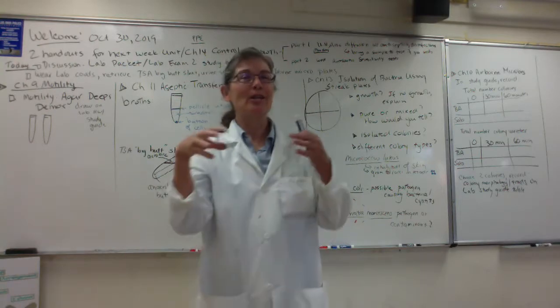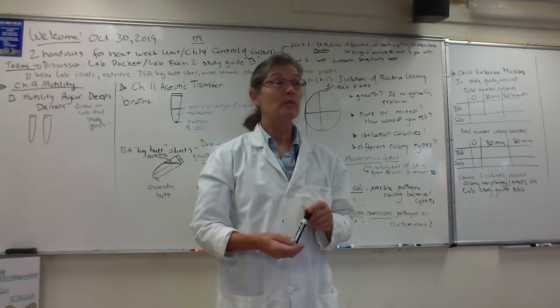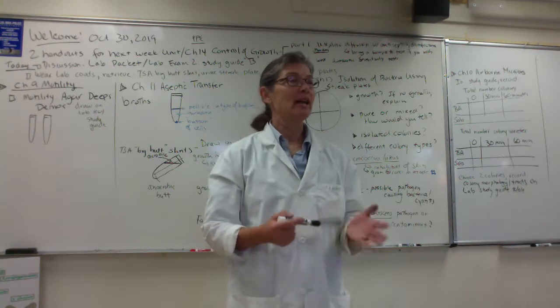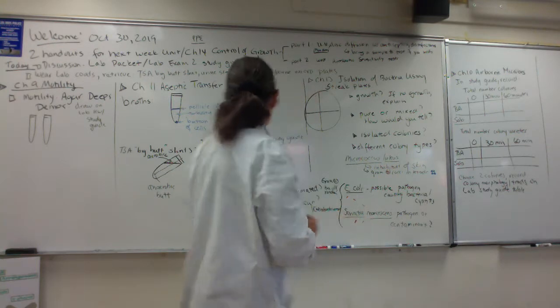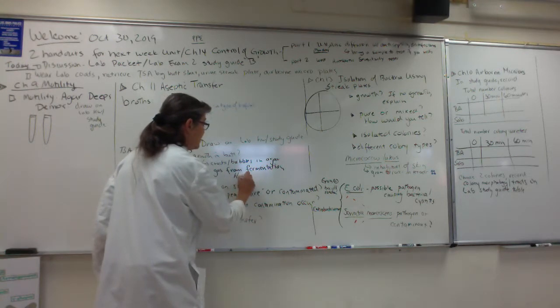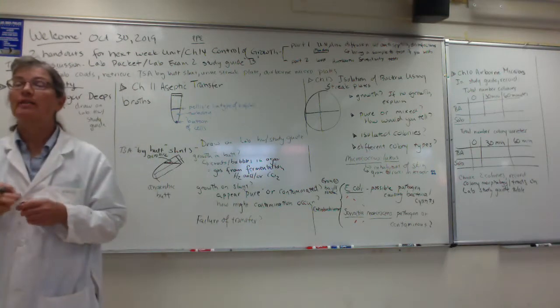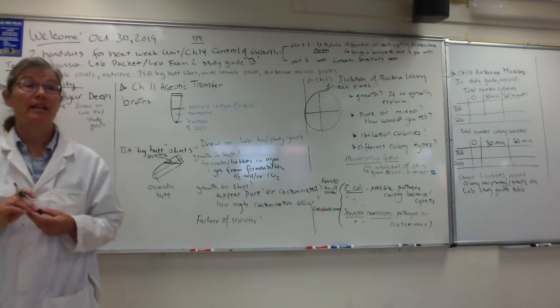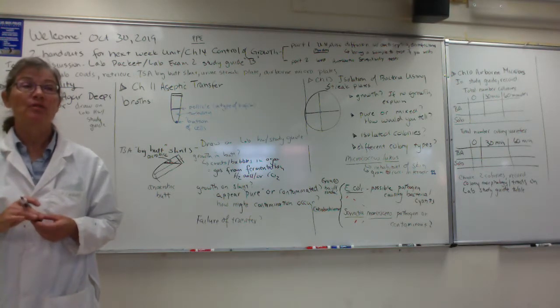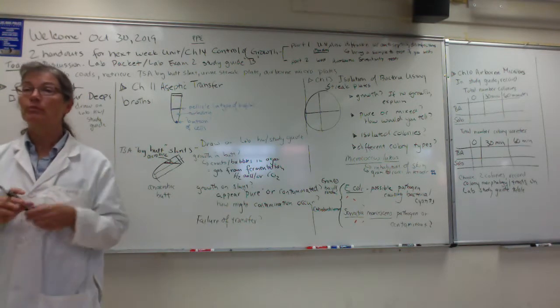Fermentation. Your E. coli is growing anaerobically using fermentation and producing what? Gases, right? The gases you classically produce during fermentation are molecular hydrogen and/or carbon dioxide. So that's what's causing the cracks and bubbles in the butt, right? Is your E. coli growing anaerobically using fermentation, producing gases like molecular hydrogen and CO2? So is that evidence that your microbe grew?